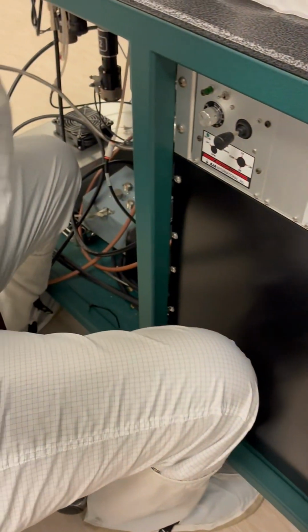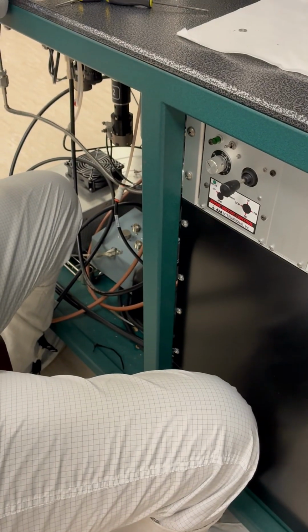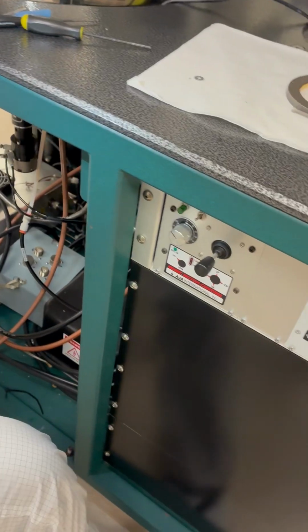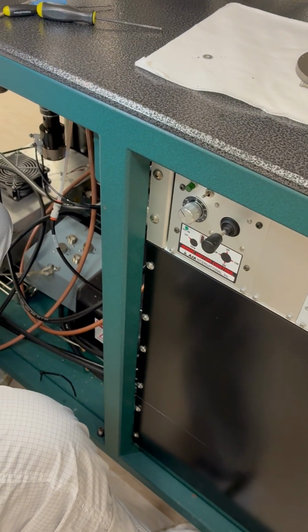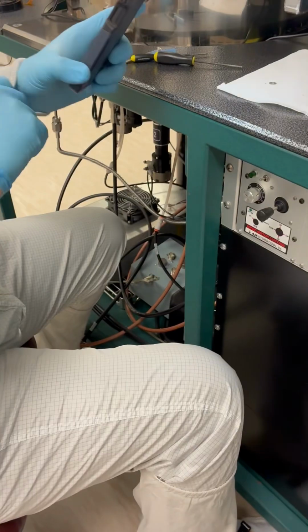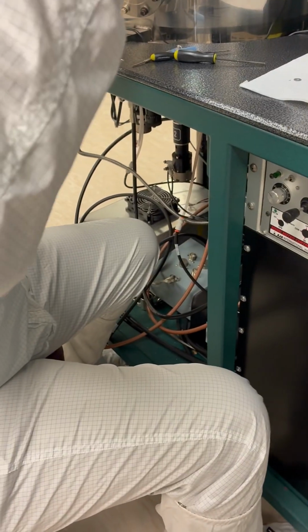The sample holder still looks like it's on the arm, and I've managed to go from the two things lined up with each other to just the screw, which is the unlock position. Now what I'm going to try to do is lift up the stage, and hopefully the sample holder is going to stay on the transfer arm.